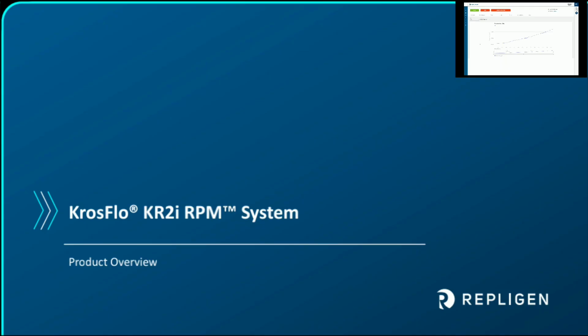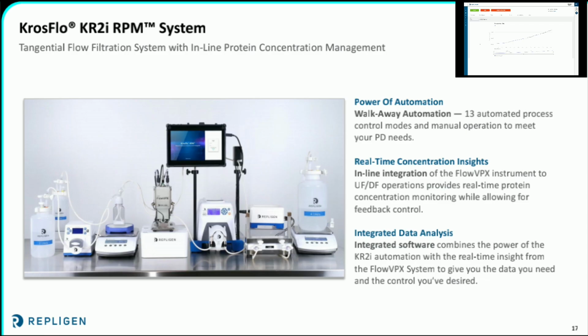So next I'll get more into the actual RPM system. Brandon will talk to you about all the components and everything that you see on the graph here. Mainly what I just want to highlight here is all of the integrated data analysis and everything that you will get from it, as well as the concentration insights.